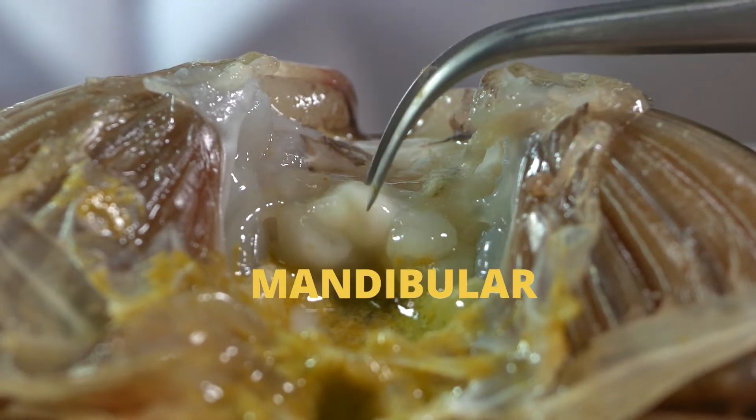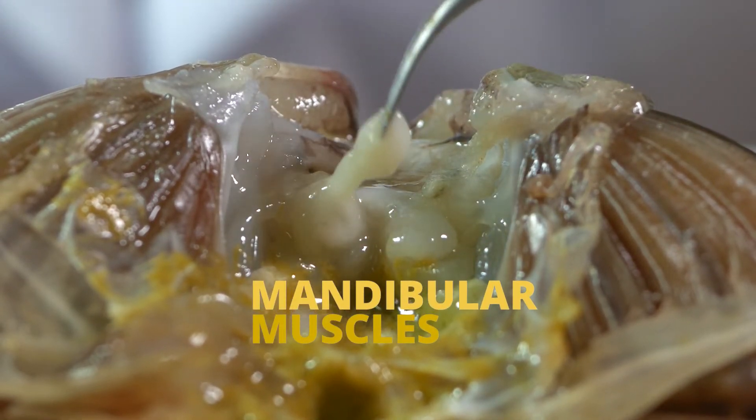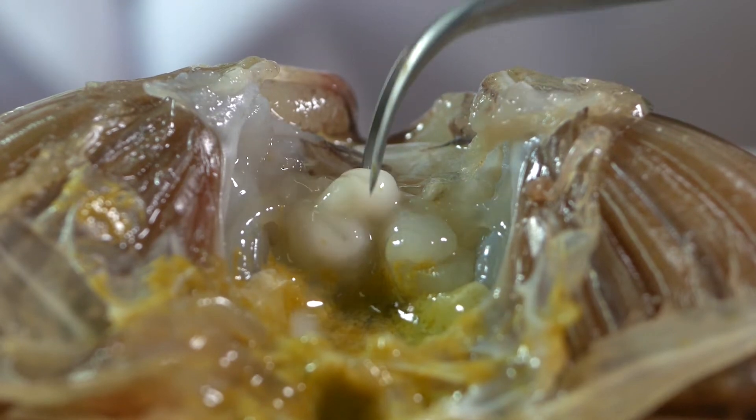For male crabs, the testis should be white in color, or visible when the animal is reproductive and ripe.